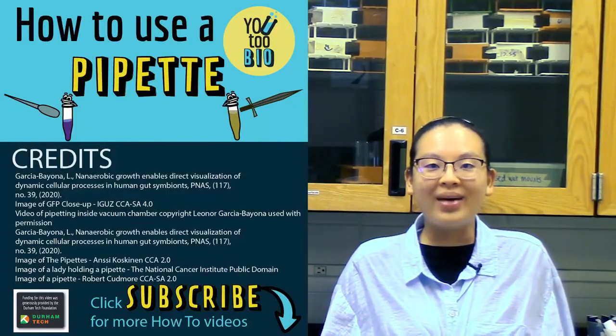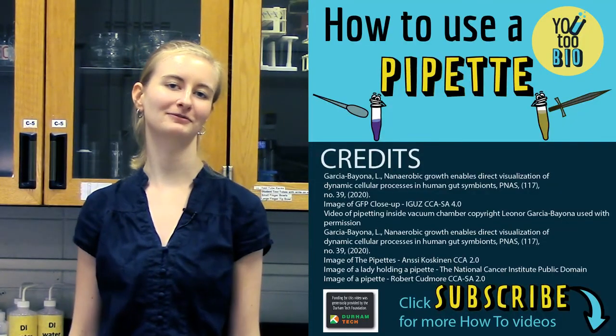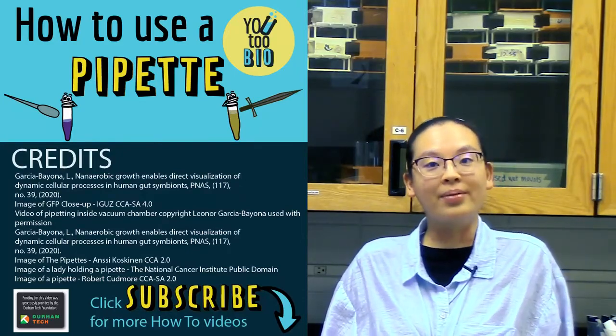Now you know how to use a pipette. Maybe you can conduct your own experiment using GFP to track bacteria. Comment down below how you're going to use your pipette.